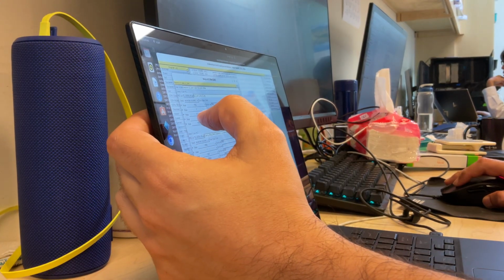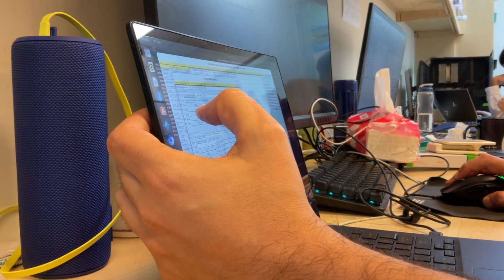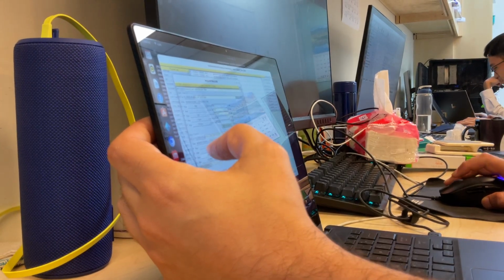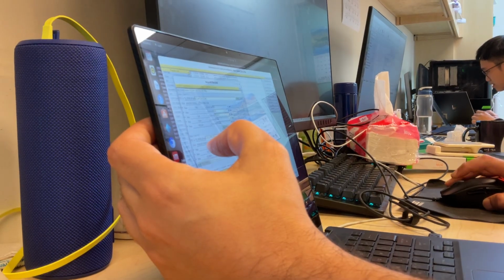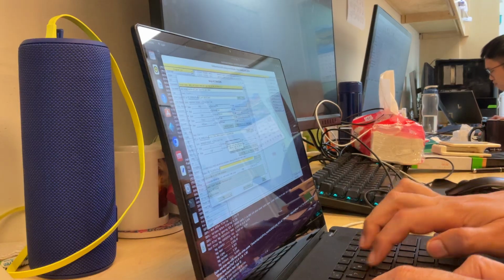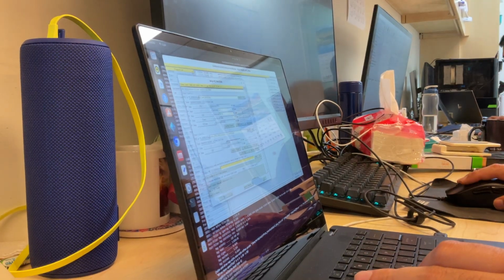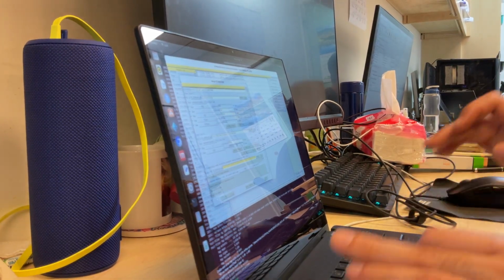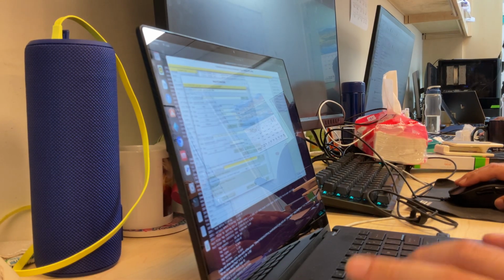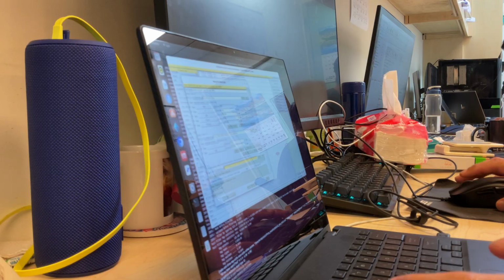So that's why we're going to delete the free one here. And also we do not want to have the intensities, just the structure factors. I'm going to rename the columns F180 picoseconds and sigF180 picoseconds so that we know what they are.